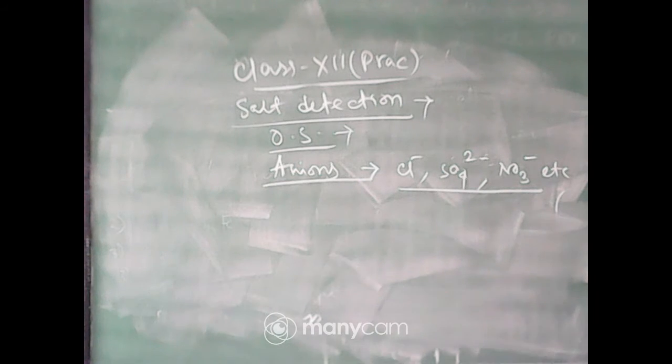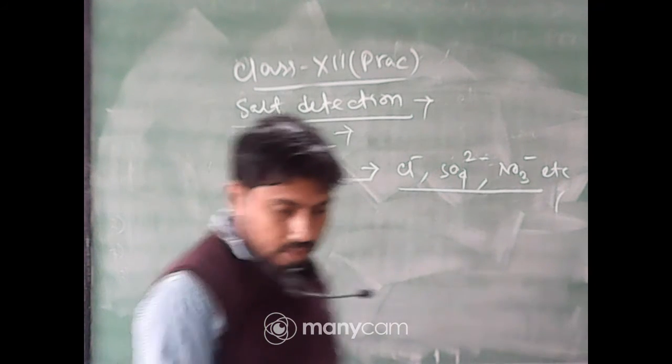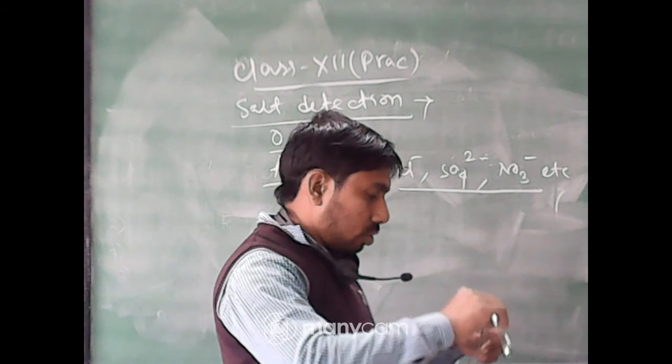Again I will show you, taking the original solution. This is the original solution, and transferring it to a test tube.